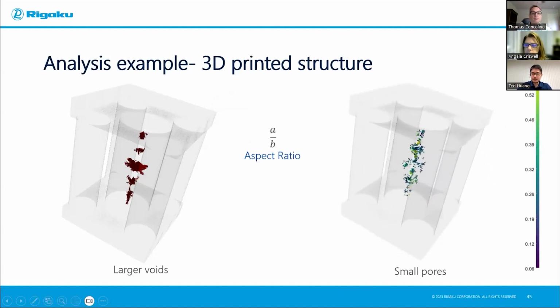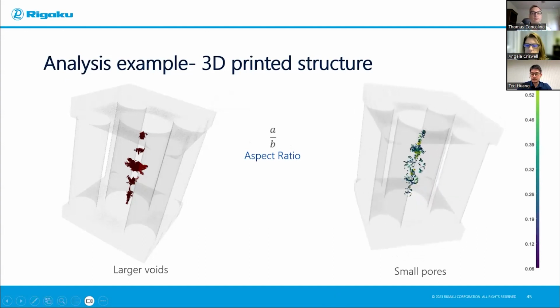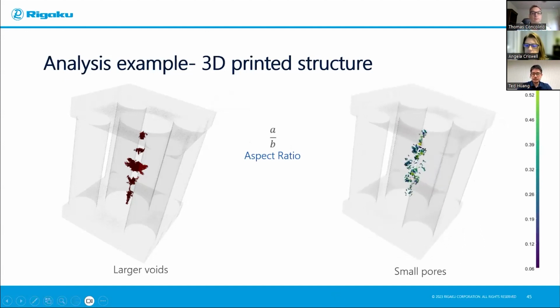And by the way, the processes and renders you're seeing so far are made using a software called Dragonfly, which is a very powerful tool for a lot of 3D analysis. And 2D analysis, you can definitely use it for SEM too.